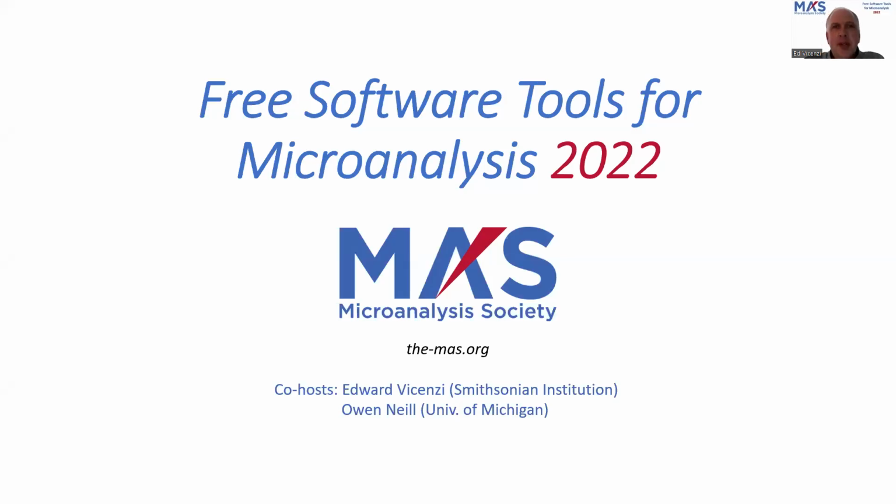Today's webinar is entitled Free Software Tools for Microanalysis 2022. And by microanalysis here, we're referring to X-ray spectrometry using the scanning electron microscope or the electron microprobe.